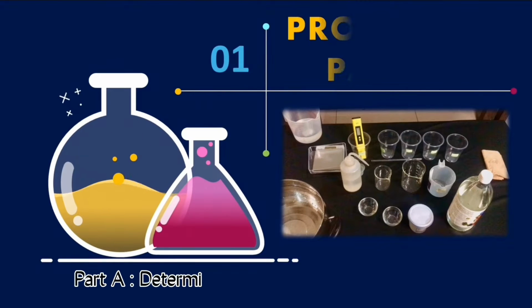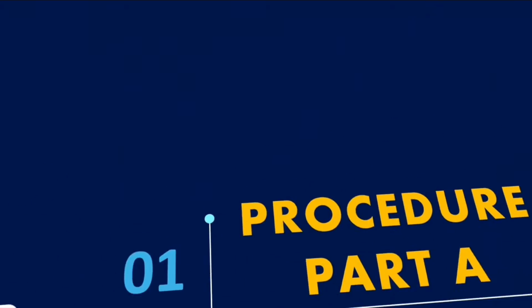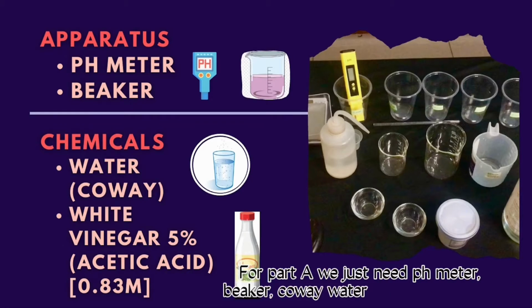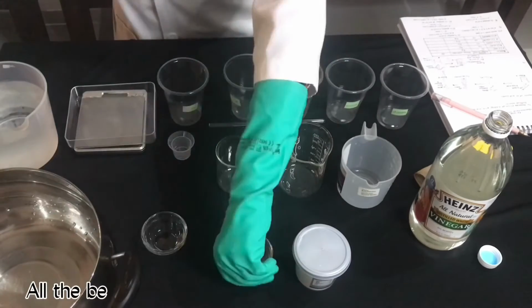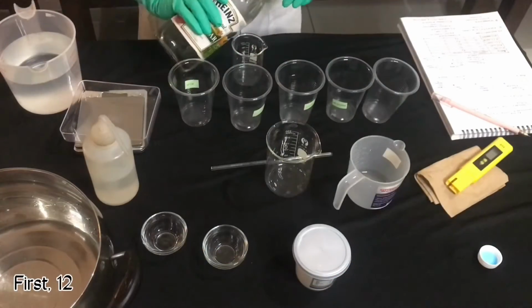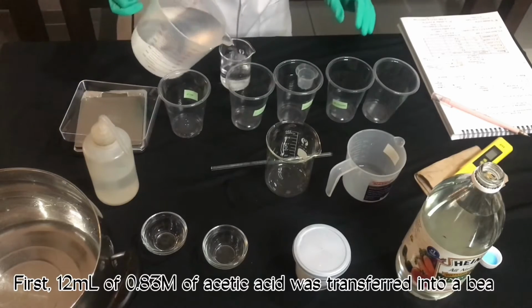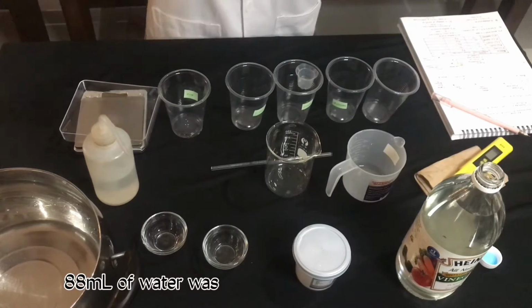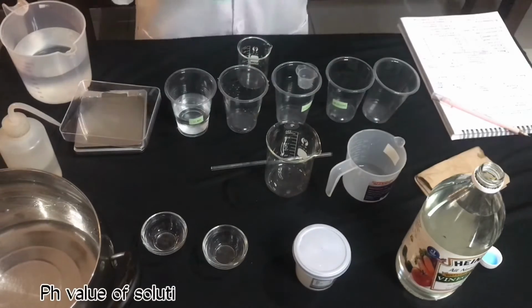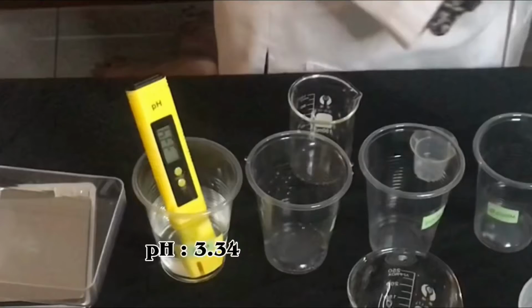Part A. Determination of pH of acetic acid solution. For Part A, we just need a pH meter, beaker, cold water and white vinegar. All the beakers are rinsed before starting the experiment. First, 12 ml of 0.83 molar acetic acid was transferred into a beaker. 88 ml water was added to prepare a 0.1 molar solution. The pH value of the solution was measured using the pH meter. So I get 3.34.